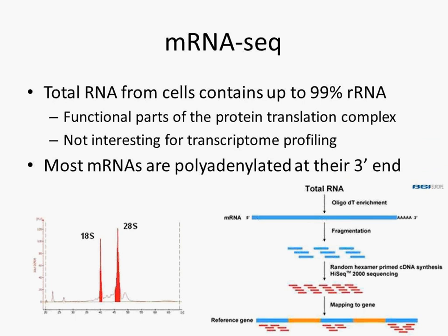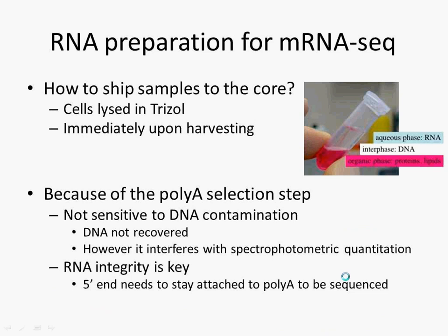So after isolating the full-length mRNAs, we're going to fragment them, and before reverse transcription and actually ligating the adapters, as you've seen in the NGS process earlier, sequence them on the HiSeq 2000. After that, the reads will align to the entire genome and fall in exonic locations, where another software will be used to quantitate them.